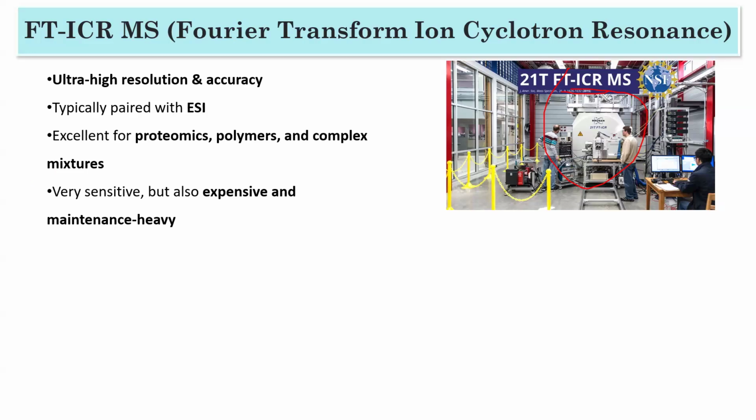Jyoti is asking, for an unknown biomolecule or organic compound, which one will be better? I think you can go for both of them. Whichever is easy, whichever you have access to, you can go for both, so both will be good. ESI is also good and MALDI is also very good. Whatever method you want to use, it should be fine.